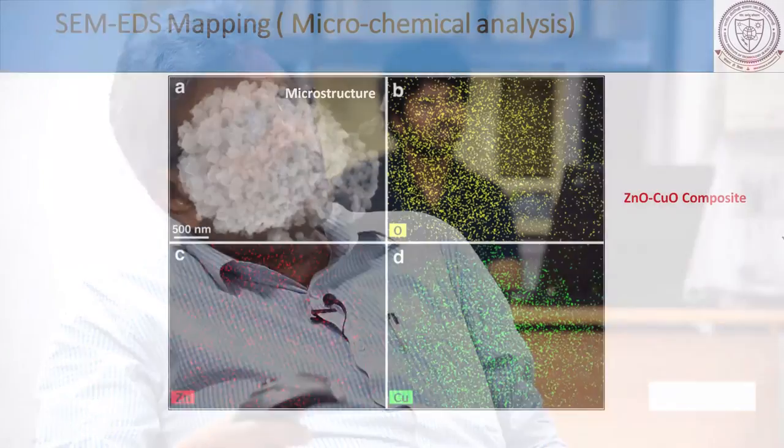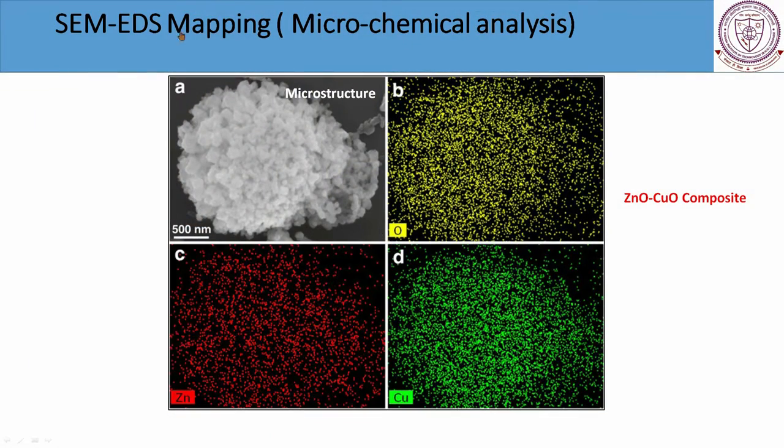In the next slide, another advantage of the scanning electron microscope relates to EDS. We will be showing you the EDX detector when I show our actual scanning electron microscope. So this is how the microstructure is going to look. This is from an oxide system. In our machine, you can nicely do oxide and metallic samples without any difficulty because it has got a FEG tip.